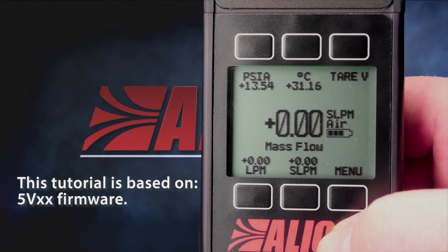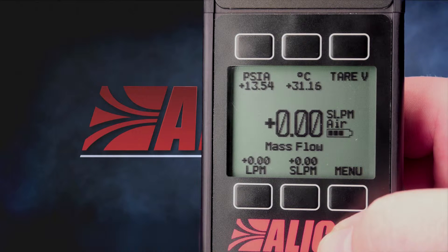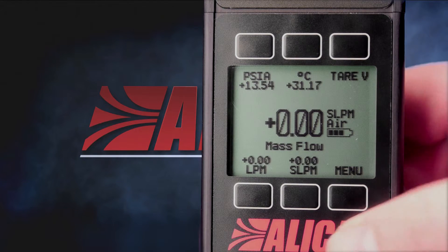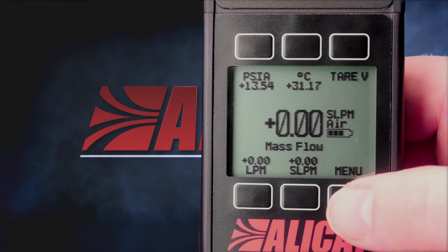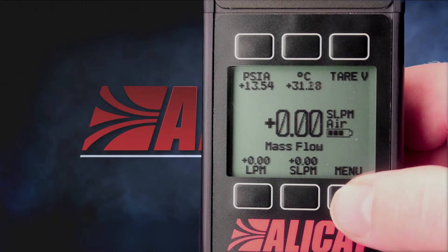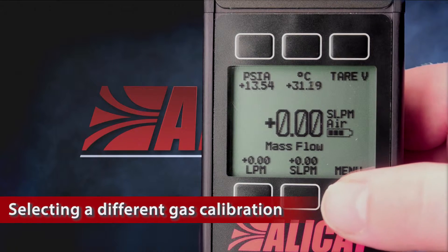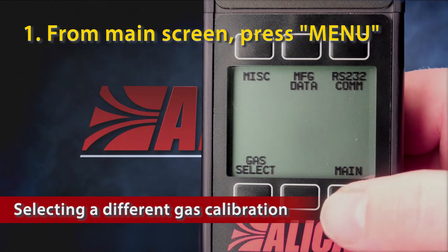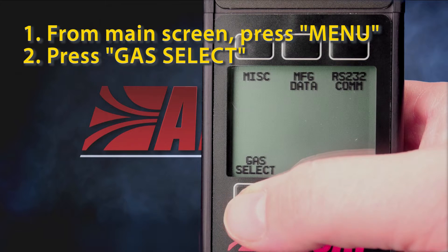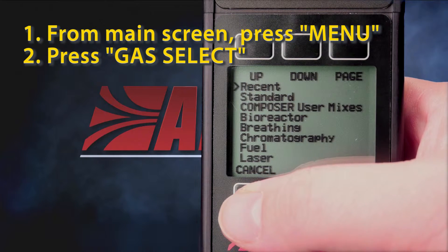The GasSelect function is our firmware that we use to switch between multiple gases and gas choices. The AlleyCat unit has over 98 gas selections of gas mixes to choose from. By selecting them we tell the unit the appropriate properties of the gas that we are measuring. From the main screen in the center we can see that our default selection is air. We press the menu button to get to our menu and see that the GasSelect option is in the bottom left hand corner. Press that bottom left hand button to go to GasSelect.